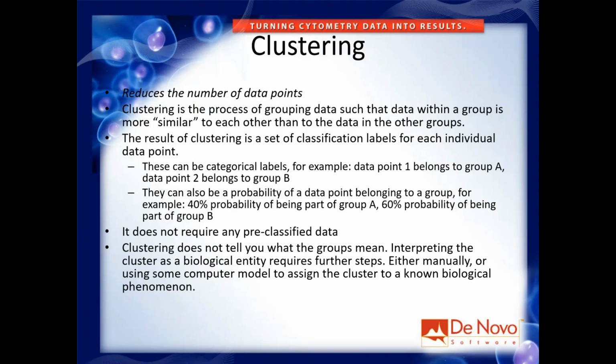But the word is similar, right? It's a totally arbitrary choice of how you decide similarity. How do you decide what makes a cell more similar to another? Usually you decide it by a distance metric, but we already saw at least 2 distance metrics. There's probably 30 others that are commonly used. So your choice of distance metric to decide how things are scored on a similarity scale is critical to understanding how things are going to cluster. And without knowing that, you're not going to understand what's going on and what your algorithm's giving you.